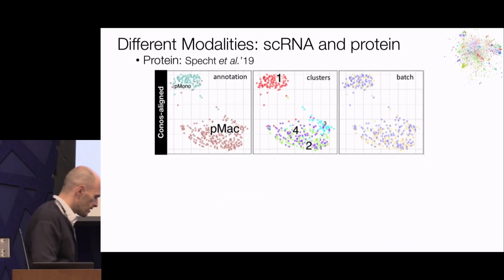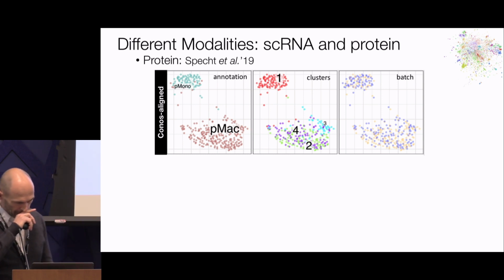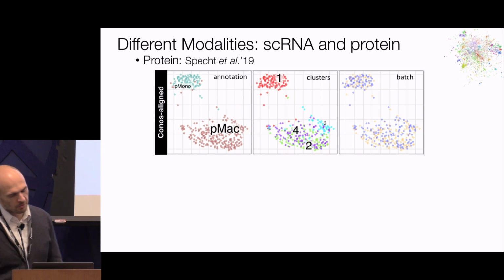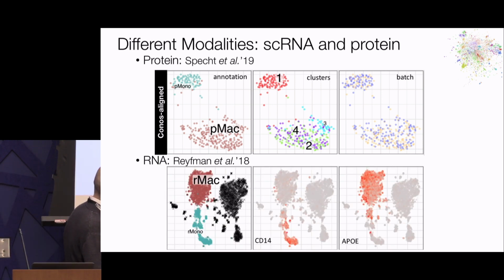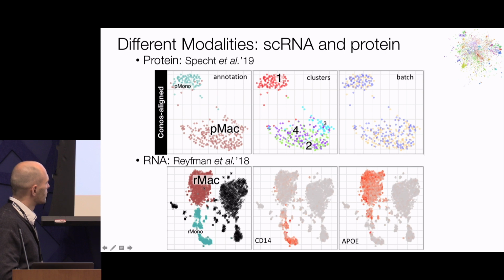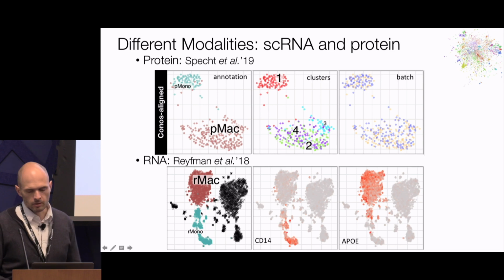Now, the RNA side. So there, I think the issue is that this was done in vitro, right? We have quite a few in vivo data sets with monocytes and macrophages, but macrophages in particular are very diverse. So I'm not sure I'm picking the right data set here, but that was my best bet. This is from lungs, from a particular patient, and it shows a nice gradient, both monocytes and macrophages in this case, plus some other cells that are unrelated to this analysis. So we'll just focus on a subset here: this is CD14 monocytes, and this is a macrophage portion.